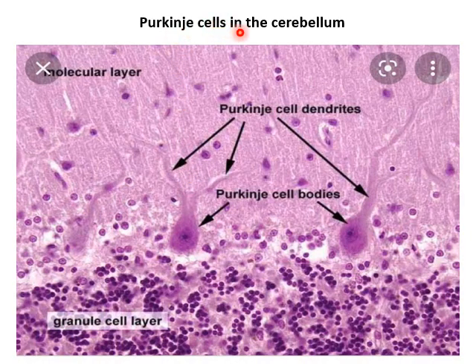Here is the Purkinje cell of the cerebellum. You know that the cortex of the cerebellum is formed of molecular layer, Purkinje cell, and the granular layer. The Purkinje cells appear pyriform, and the processes extend to the molecular layer, and the cells are present only in one layer.